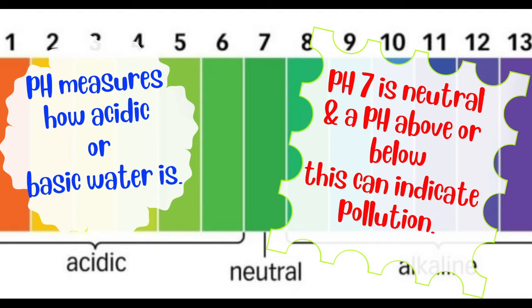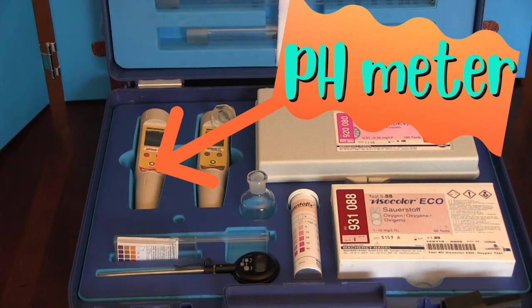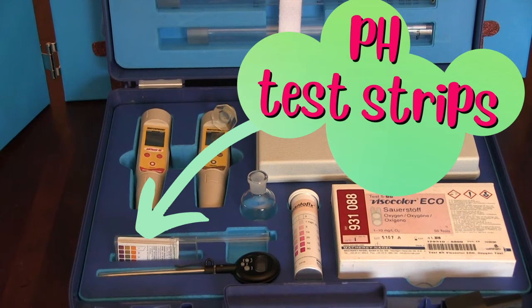pH measures how acidic or basic water is. We want a pH of roughly 7 for our water, as above or below can indicate pollution. To test pH, we're going to use the following from our water test kit: our pH meter and pH test strips.